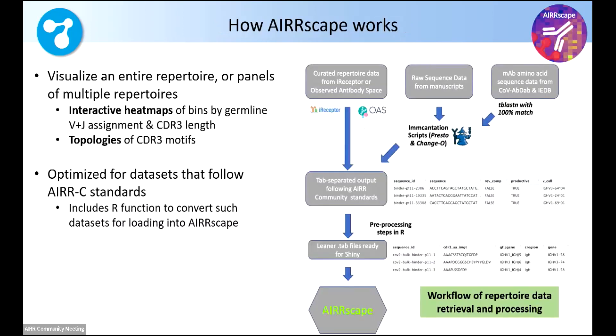So that's where Airscape comes in. We're visualizing entire repertoires or panels of multiple repertoires. The way it's doing this is by looking at heat maps, taking the entire repertoire, binning it into germline V plus J assignment in CDR3 length.